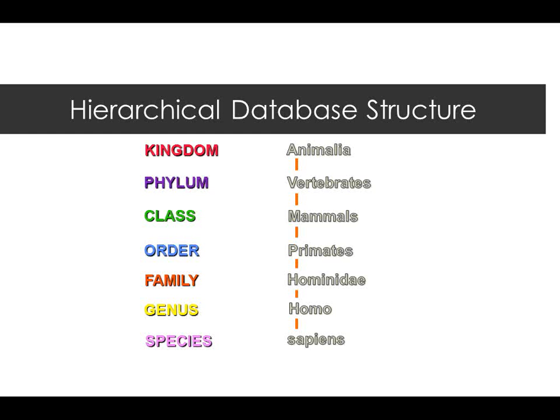You've got multiple branching pathways that you can go down, and to hit that one piece of data, you have to tell the system, this is where I want you to go. Okay, so that's the typical hierarchical database structure. Obviously, to get at one piece of data can be relatively fast, but to search through that can be relatively slow.